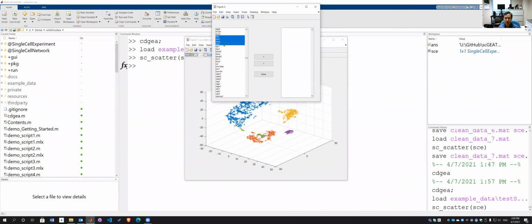For example, you can select a couple of genes using this multi-gene selector panel. I just randomly select a few genes, but if you have an idea of what genes should be selected, for example, genes involved in the oxidation process, you may want to group those genes, because at the end, the gene regulatory network you build will make more sense to you because you know what kind of molecular process you are working with.